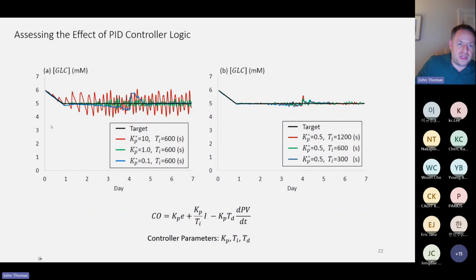You know that a poorly parameterized PID controller will yield oscillations, will be slow to respond, will have a lag, as it were, in response to changes. As opposed to going through commercial batches and trying to optimize those parameters in the field, we can do it completely in silico and go back to the vessel and say, this is your gain, this is your reset, and this will be your response.